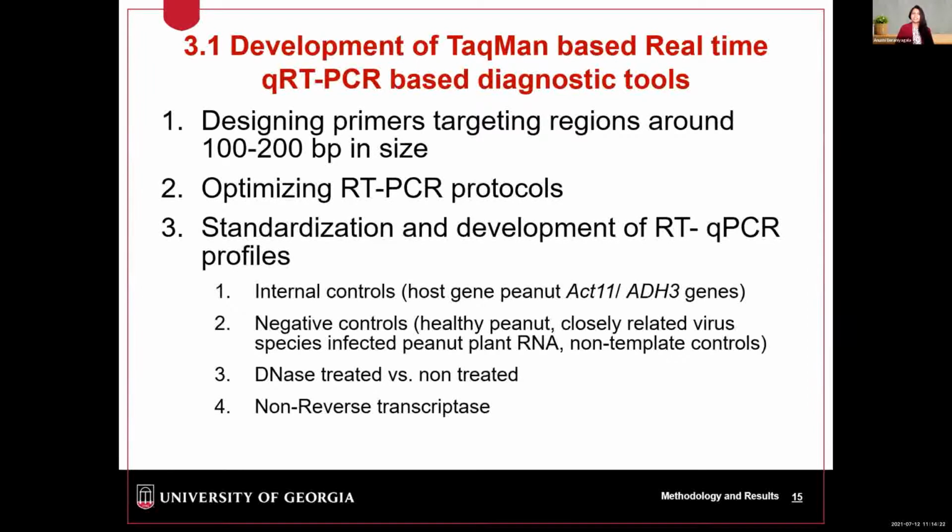In addition to that, DNase-treated RNA versus non-treated RNA, and reaction mix with and without reverse transcriptase were also used.